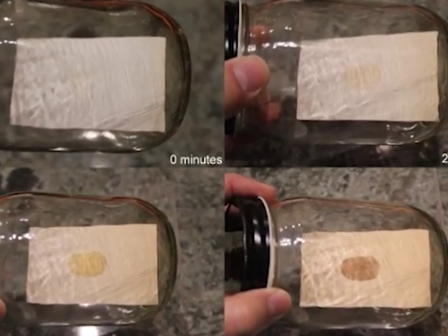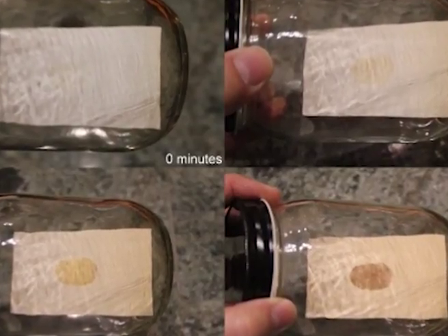Nevertheless, it is possible to fix the prints by using iodine in conjunction with other chemical reagents. Iodine is known to react with starch, giving a stable deep blue complex. Thus, post-treatment of iodine developed fingerprints with starch solution gives long-lasting blue impressions.